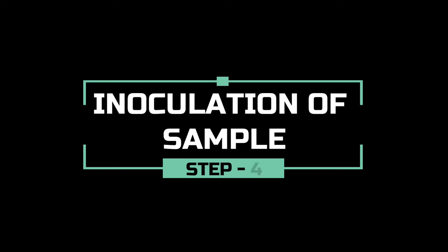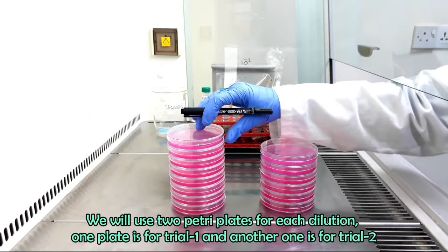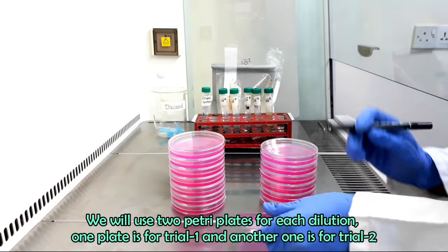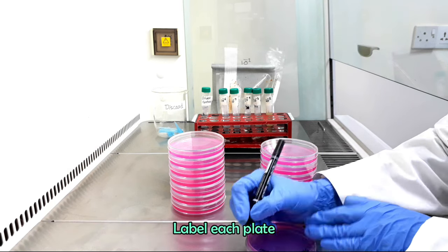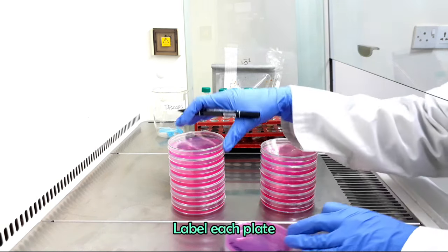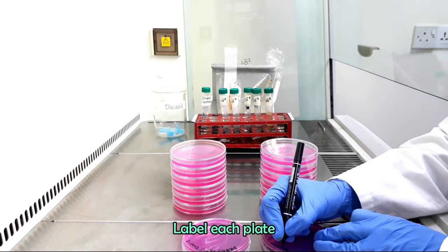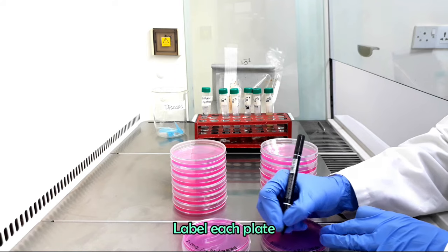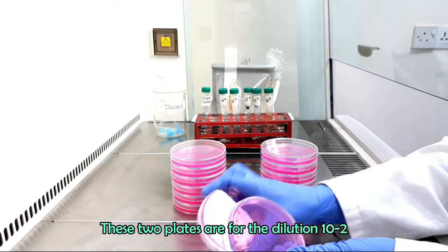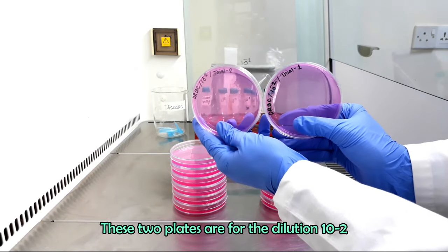Now we will isolate yeast and mold from each dilution by spread plate method. We will use two petri plates for each dilution. One plate is for trial 1 and another one is for trial 2. Label each DRBC agar plate. These two plates are for the dilution 10 inverse 2.